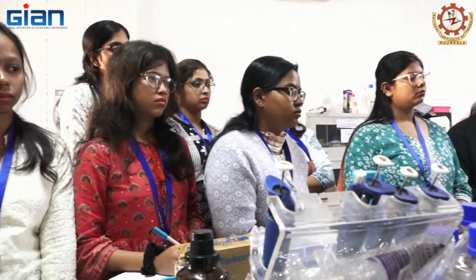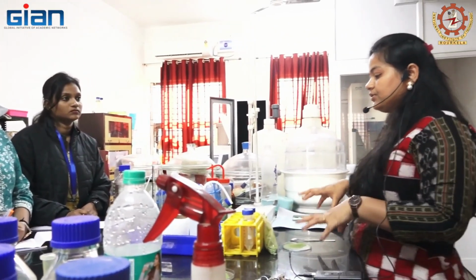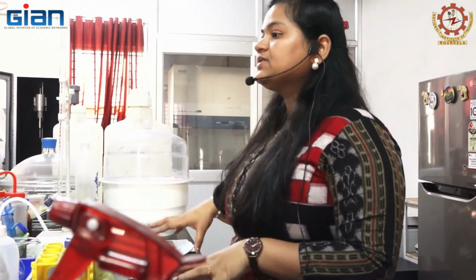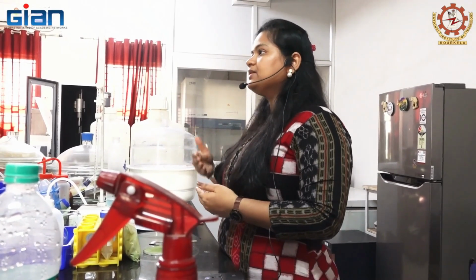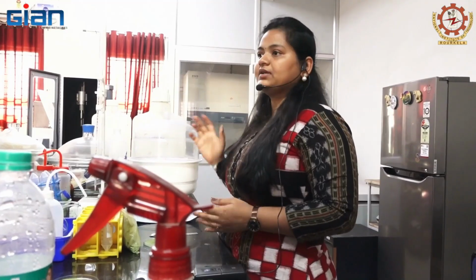Got it? In these ultrasound waves, we are putting in external force in the form of ultrasound waves. Conventional extraction is mainly about mechanical stirring. Overnight or 24 hours or 48 hours you have to stir it to solubilize the bioactive compounds present inside the cells into the solvents.